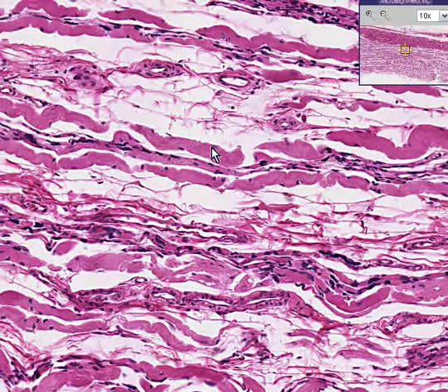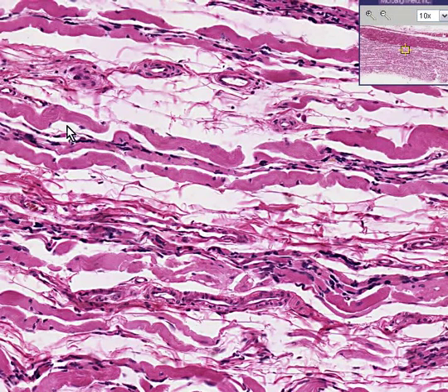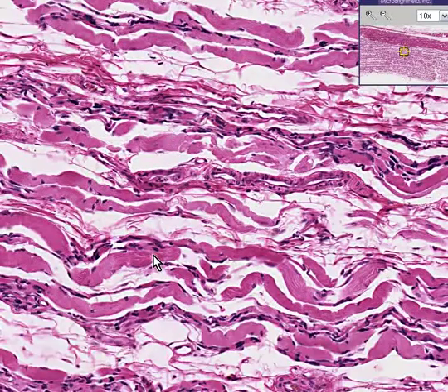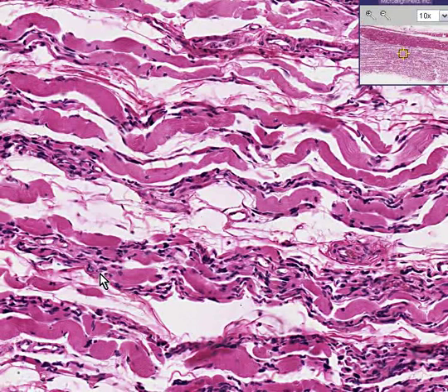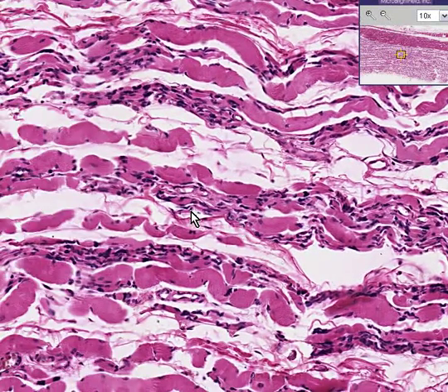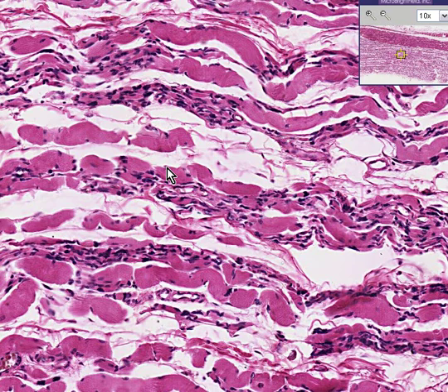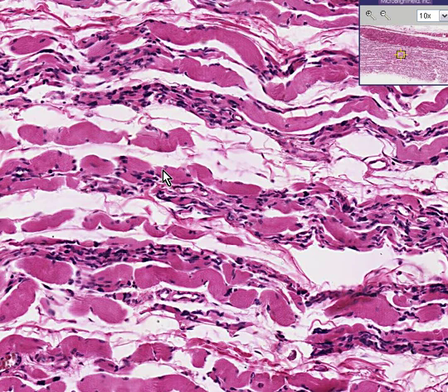The nuclei are still at the periphery, as you can see here, but basically this skeletal muscle is being replaced slowly by fat. This is classic for atrophy of muscle, the most overwhelming cause of which is denervation. Thank you very much.